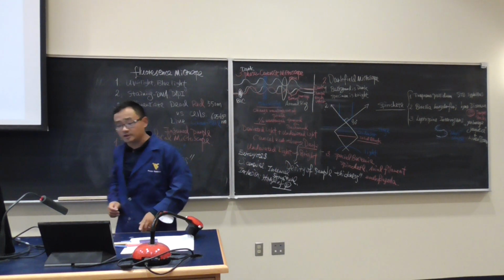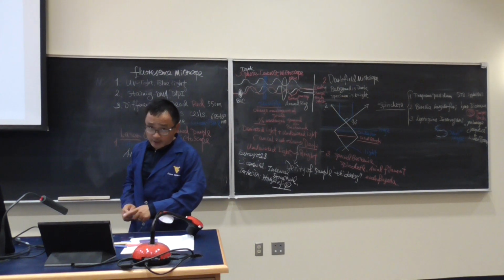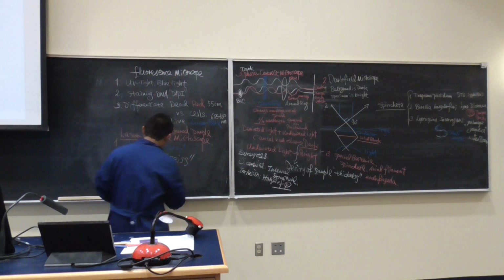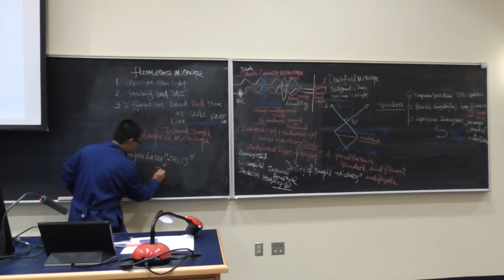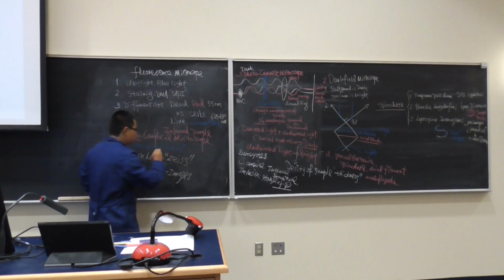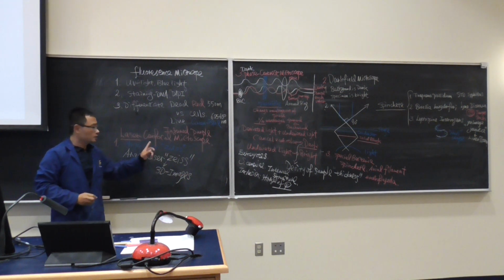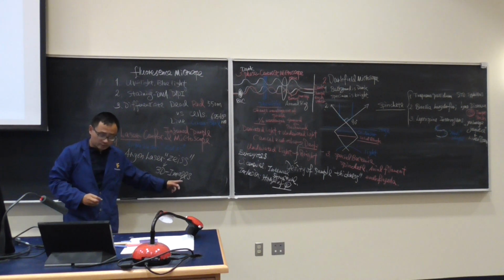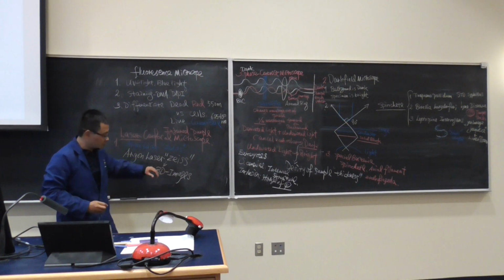And the good thing, laser confocal microscope is connected to the computer. So you can see 3D images. Not many traditional microscopes you could use, except the electron microscope, can show 3D images.